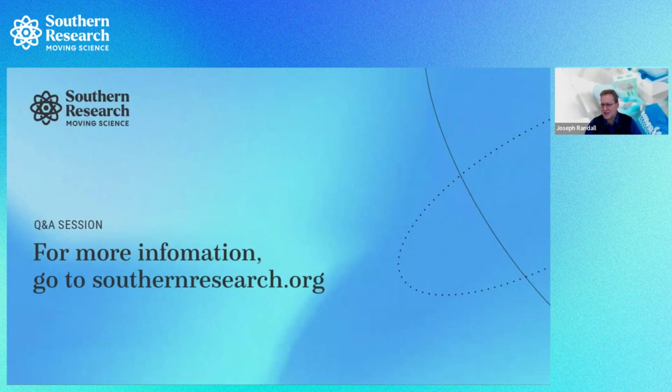So here's another question: what is the Stamaril LD50 in the neonatal mouse model in your experiment? We are doing some additional work to confirm the LD50, but it's going to be between 1 and 10 PFUs. And we will determine that in future studies. But on a side note, I heard from a colleague that it was ostensibly in the 5 PFU range, but we'll need to confirm that.